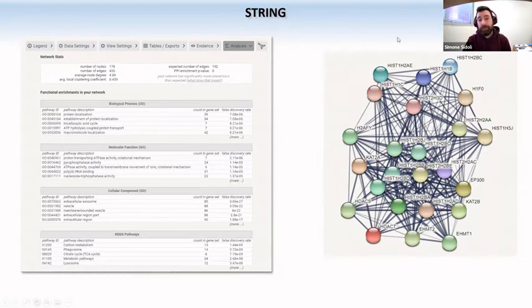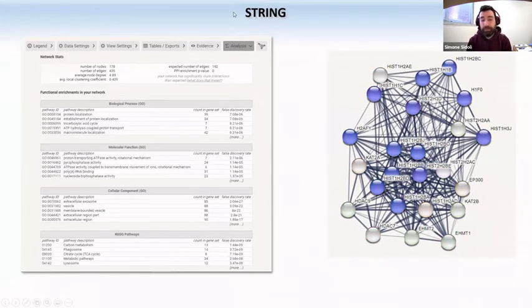Software like STRING also has analysis patterns where you can color proteins for a specific function, which helps you tell what all the proteins involved in this or that are. Obviously, keep in mind that, like I said before, STRING uses the human genome as a background. So these p-values that tell you how enriched your function is are biased, because your experiment is biased.